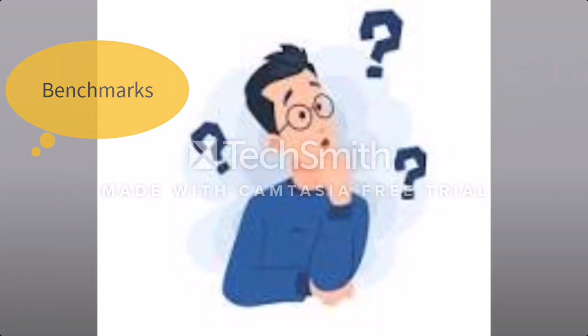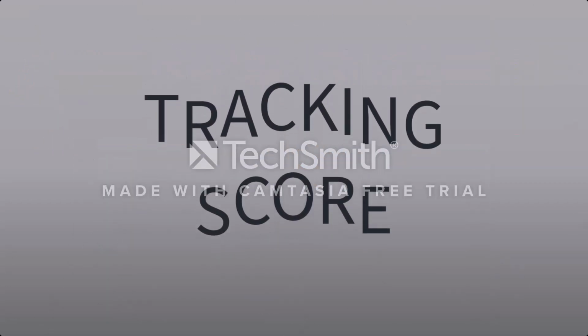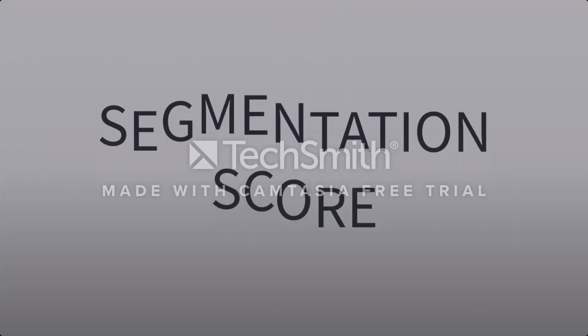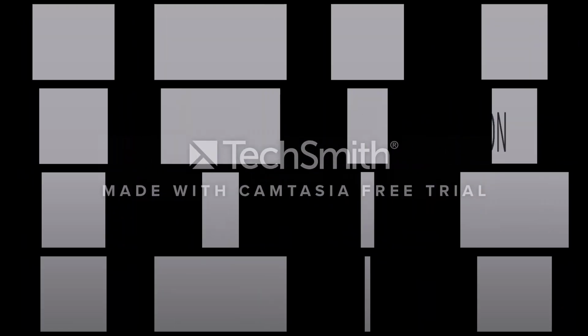This will help us analyze the benchmark results and draw some inference whether the dataset is relevant in terms of the score observed and whether we can use it for real-time use cases. For evaluation purposes, two types of scores are used. First being the tracking score, which assesses how accurately each given object has been identified and followed in successive frames. Secondly, a segmentation score is used which assesses how well the segmented regions match the actual cell or nucleus boundaries by comparing the cell instance segmentation masks.